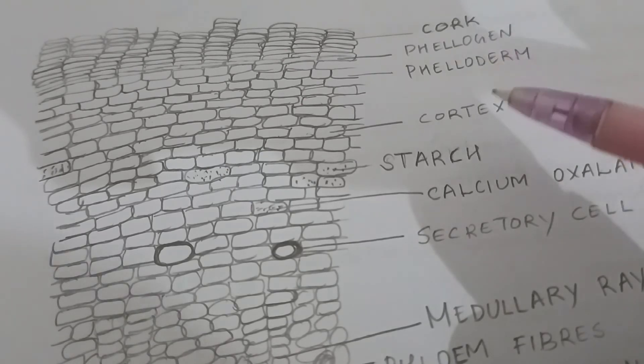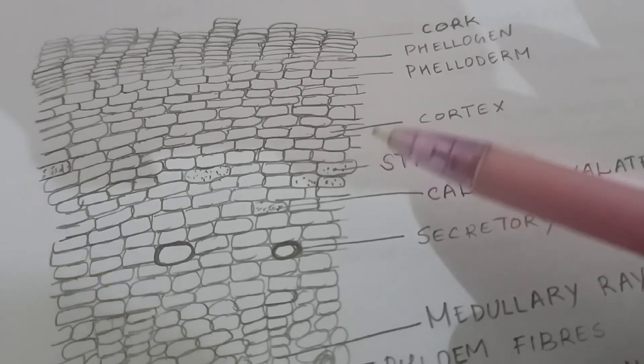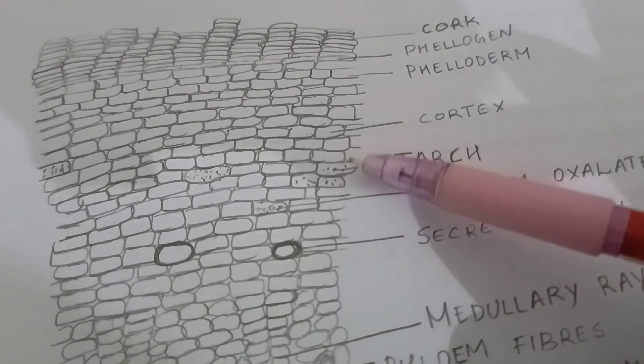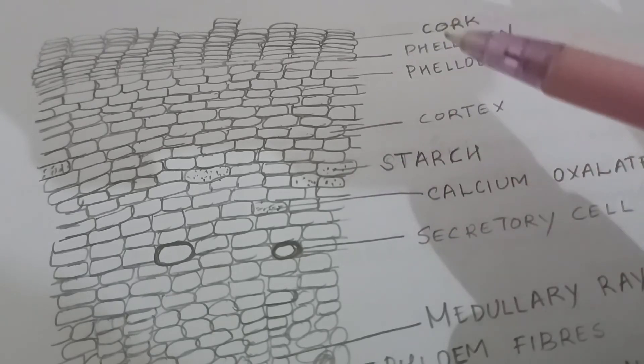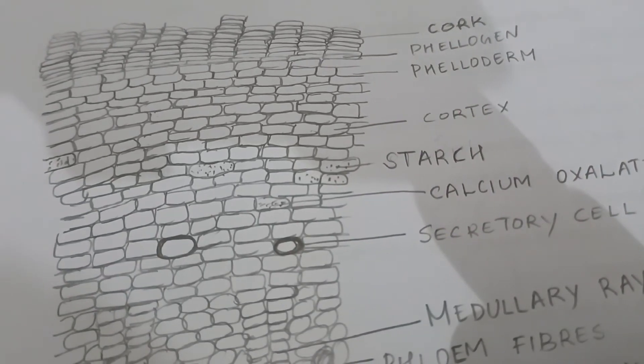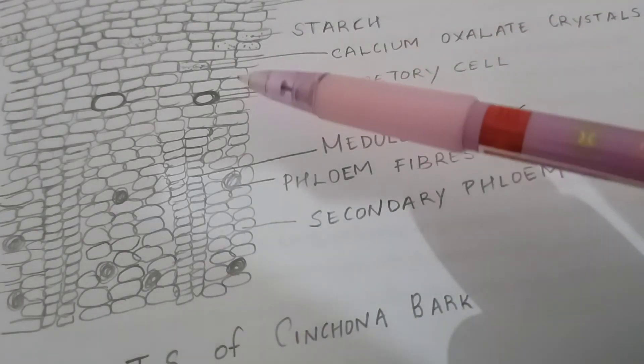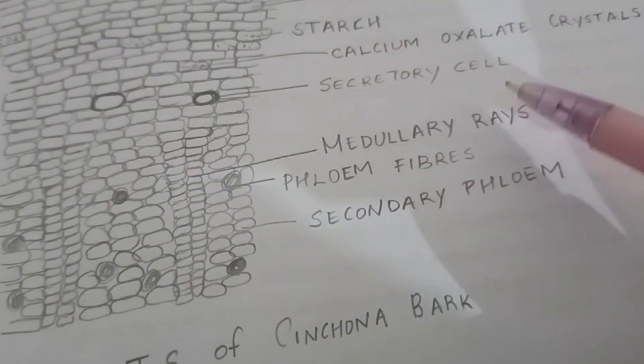Some of the cortical cells are filled with microsphenoidal crystals of calcium oxalate, while the rest with minute starch grains are 2-6 micron long, whereas starch grains are 6-10 micron in diameter. Isolated secretory cells are also found in the cortical parenchyma.